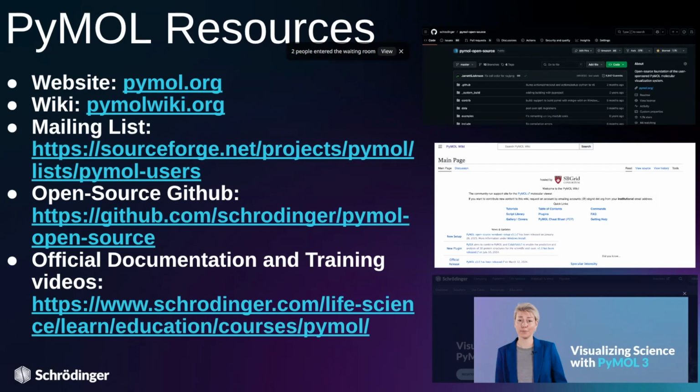Schrödinger has also provided some documentation and training videos, especially for PyMOL 3. This is available through our Schrödinger website. The link is here on the slide. It offers a Schrödinger curated list of educational modules that are video backed, and you can obtain official recognition for completing these courses as well.